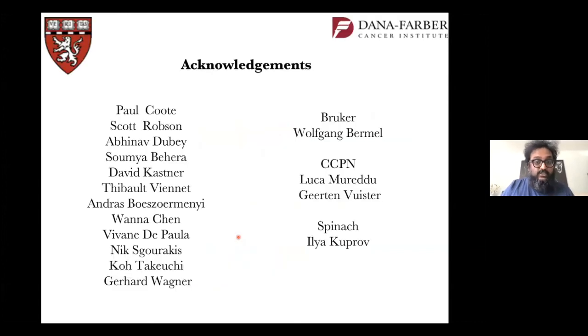With that, I'd like to thank the people who did the work. The optimal control design was done by Paul Coote. The pyruvate labeling was done initially by Scott, followed by Abhinav, David, and Andras. We are trying to incorporate our pulses into the standard Bruker library. The BATCOP pulses are already available, and all you can do is do a getprosol, and you'll be able to execute that with the help of Wolfgang.